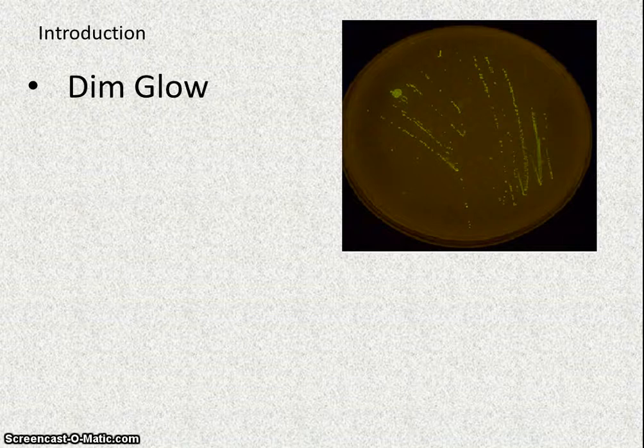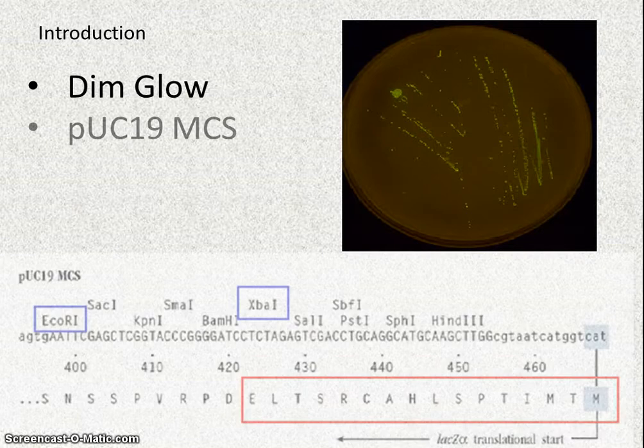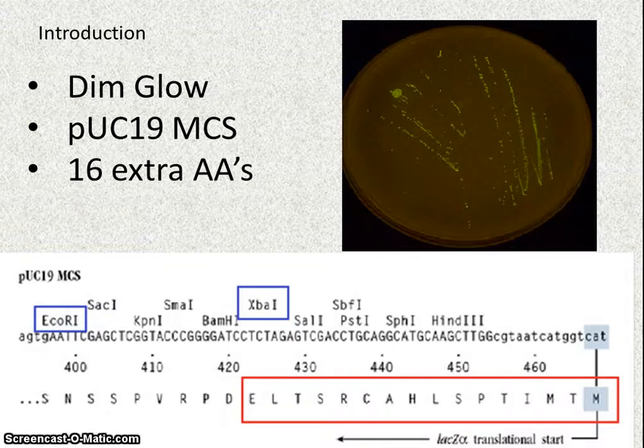Through collaboration with my molecular genetics teacher, Mr. Henry Weeks, two hypotheses have been supposed to explain this lack of GFP expression. The first hypothesis concerns the fact that when the GFP gene is cloned into the plasmid pUC19, there are about 16 extra amino acids coded for between the start codon of transcription and the start of the GFP gene itself, represented by the red box in the PowerPoint. This means that 16 extra amino acids are added onto the protein, possibly changing its shape enough to decrease the expression of the gene.